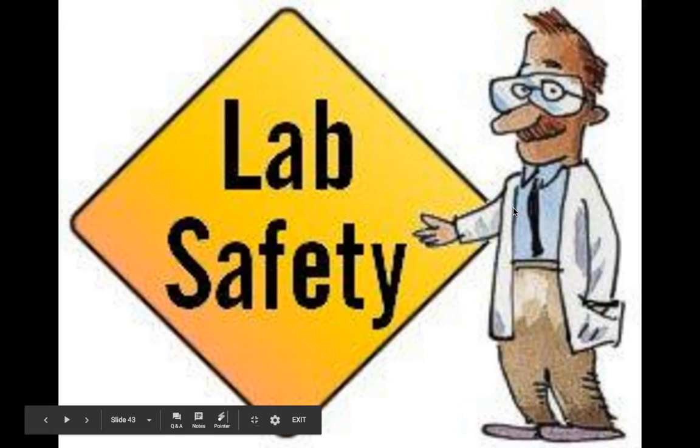Welcome to the lab safety notes, part two. Part one was the longer part — the first page and the top part of the second page of the notes, which took about 20 minutes. These next two parts, which I'm dividing into two videos, will be much shorter.